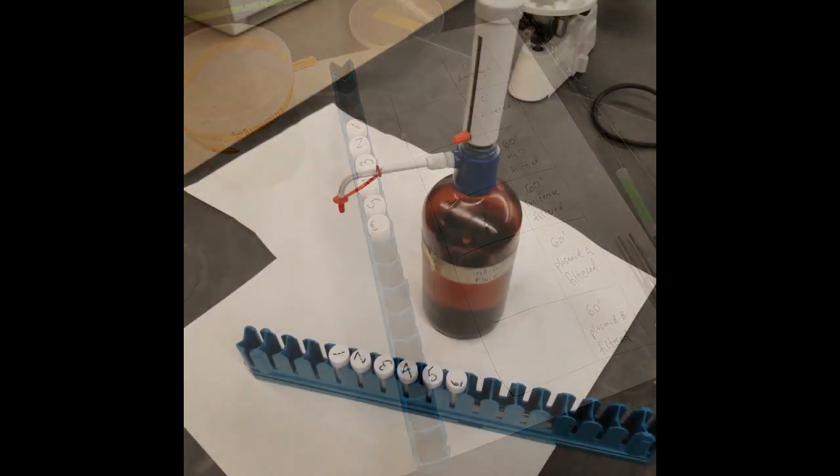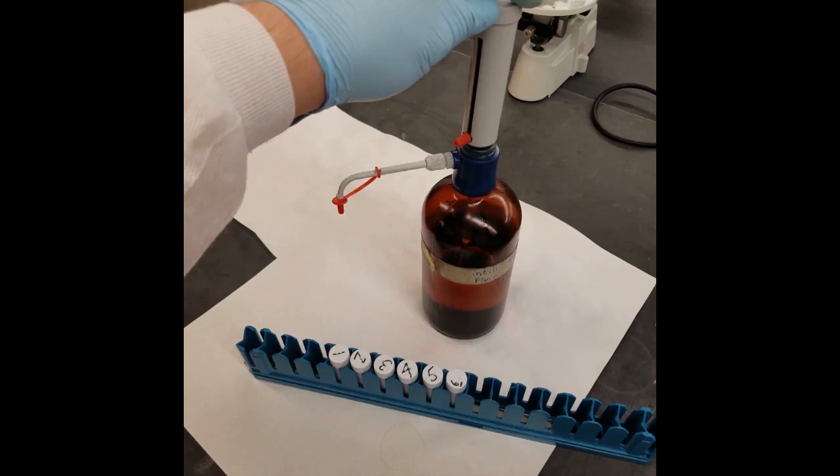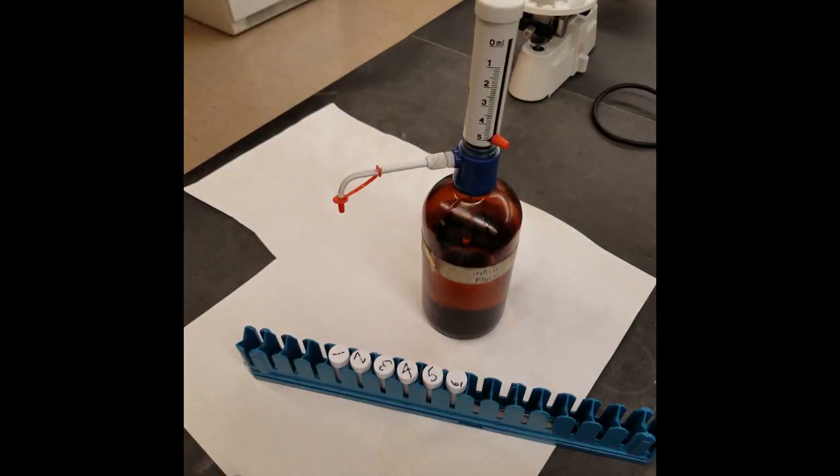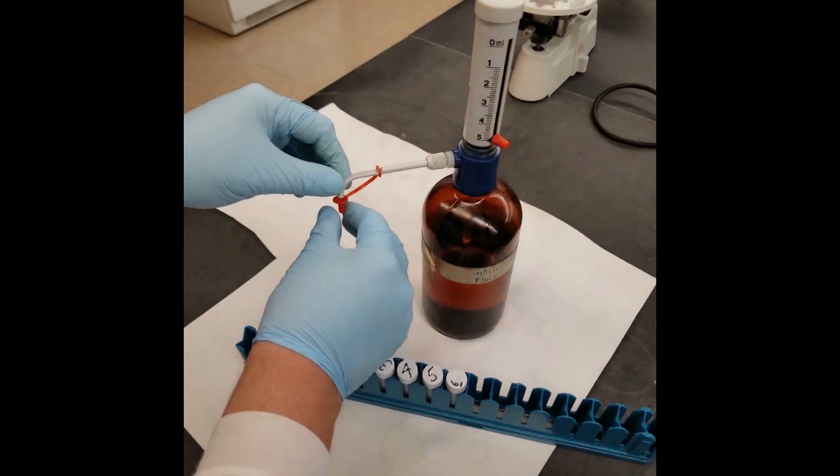Take your vials containing your filter samples to the scintillation fluid station in the lab. Notice that the dispenser will already be set to dispense 5 milliliter volumes per pump.